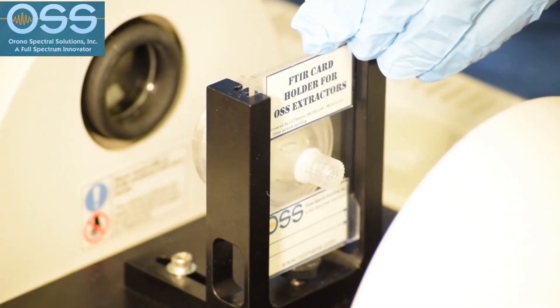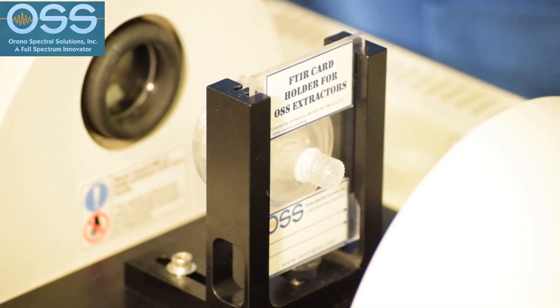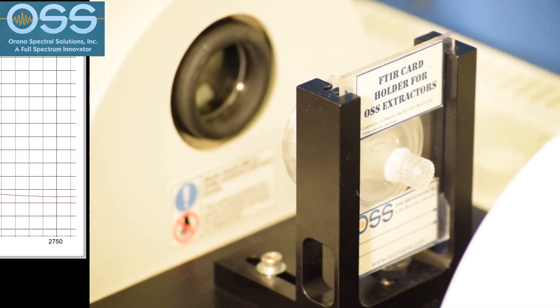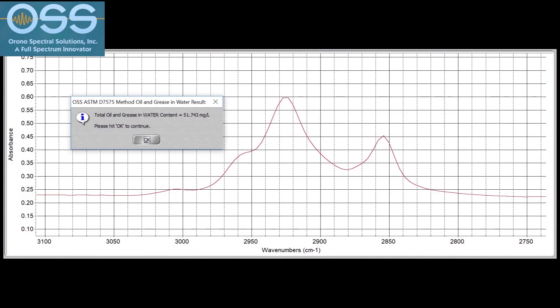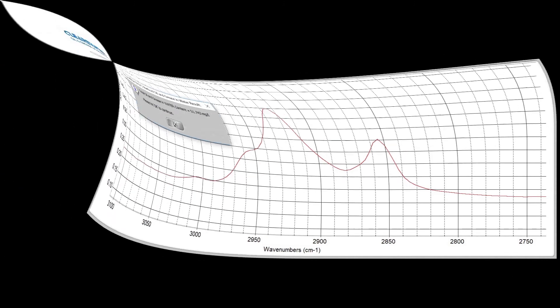The dried extractor is then placed in the FTIR unit, and the oil level determination and oil identification takes place in seconds.